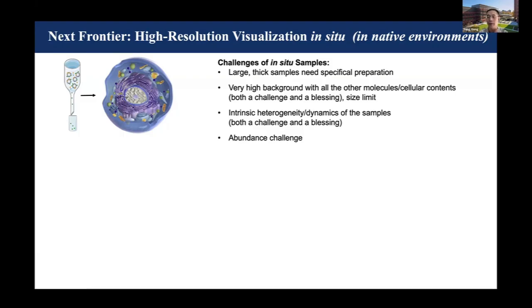On the other hand, you can think this could be a challenge how to deal with this, but also it's a blessing if you could deal with it, meaning when you collect data, everything's in there in your data set. But of course, because of the high background and the crowdedness, it's going to be hard to achieve the same resolution for the same size of molecule. Basically, we have a bigger size limit. Those are the challenges the field is still facing.